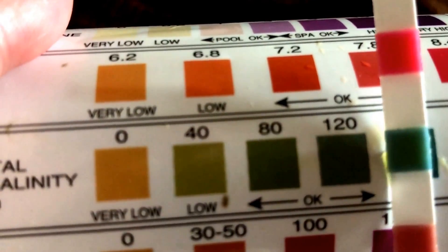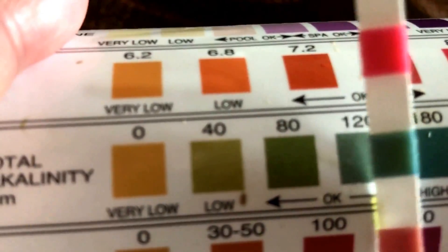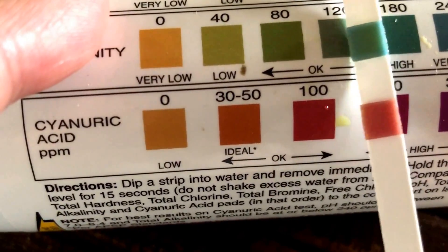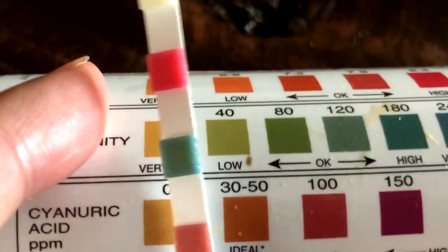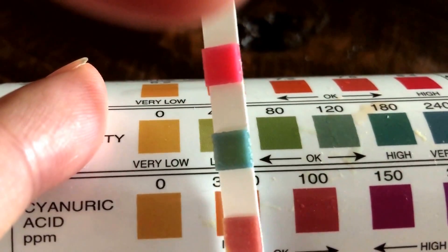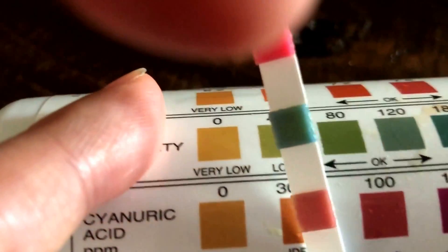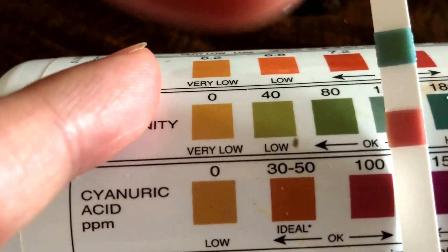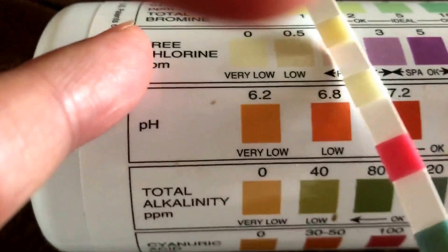Total alkalinity — you can see that I am actually okay on that one, and I believe that can also be taken care of by adding muriatic acid. Then the final metric is cyanuric acid. I just looked it up — cyanuric acid seems to be a chlorine stabilizer, or it helps these chlorine indicators right here.